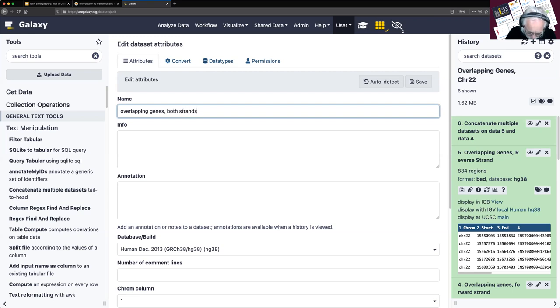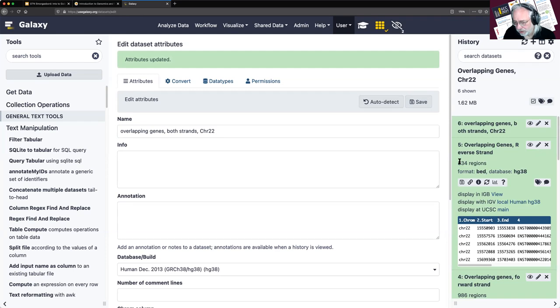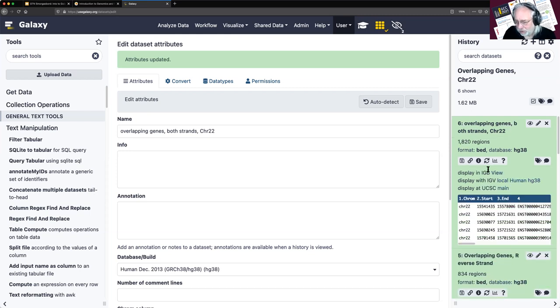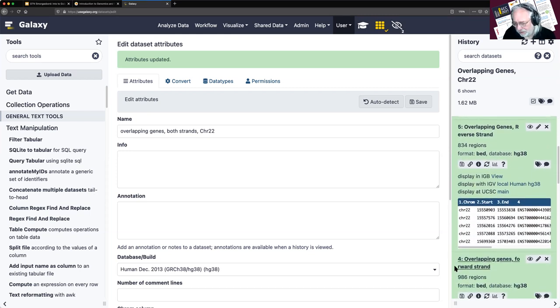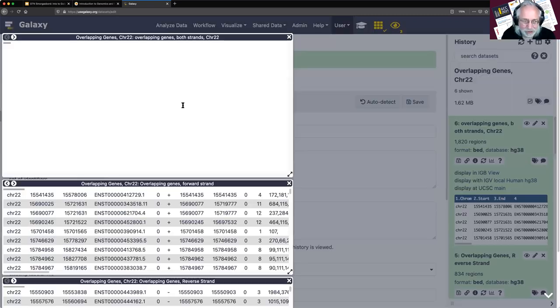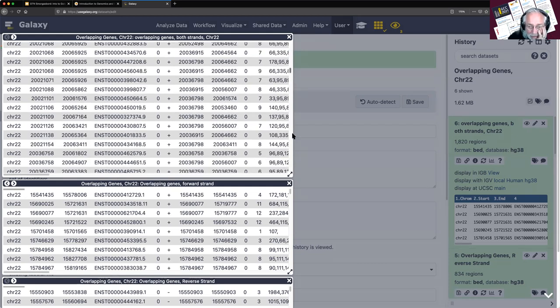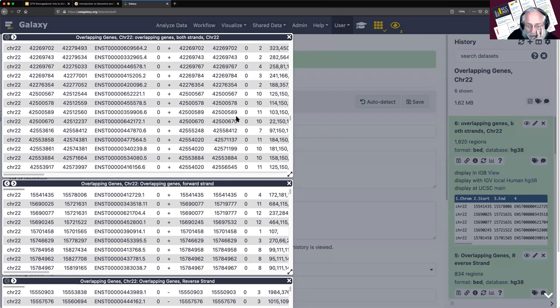I select both overlapping gene datasets using shift-select, and execute. Our expectation was 834 + 986 = 1820, and yes, we got 1820. If I poke it to view, we can see it did just stack them with all the pluses on top and the minuses at the bottom.